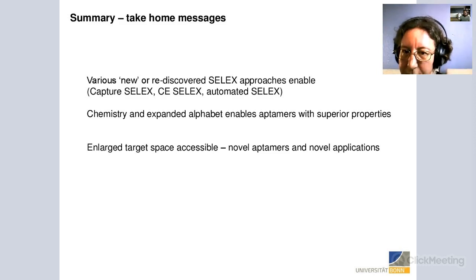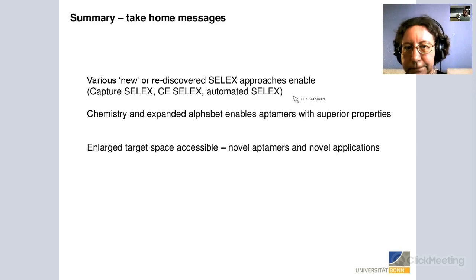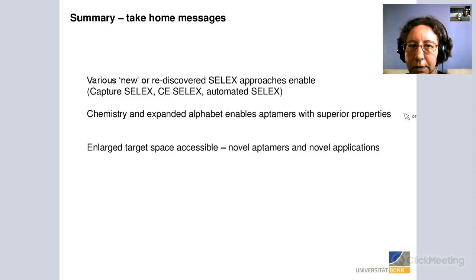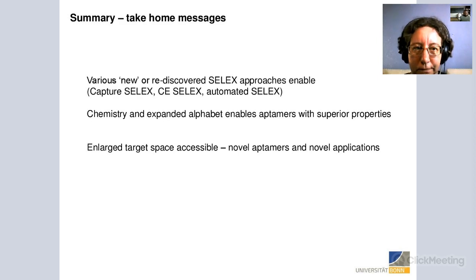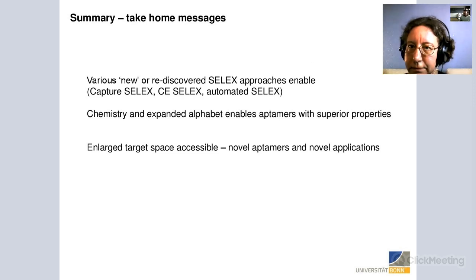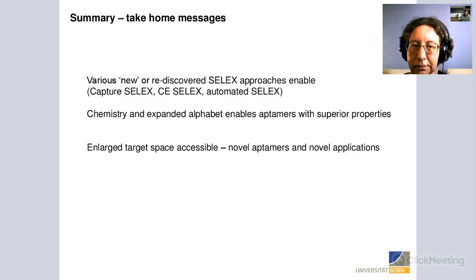Dario asks: would it be possible to get rid of PCR bias by next-generation sequencing analysis? No — NGS is done after the selection, so you can't eliminate PCR bias that way. PCR bias is an inherent property of the library, not of the downstream analysis method. You can avoid it by careful primer design, emulsion PCR, or droplet PCR, but NGS alone wouldn't be helpful for this.